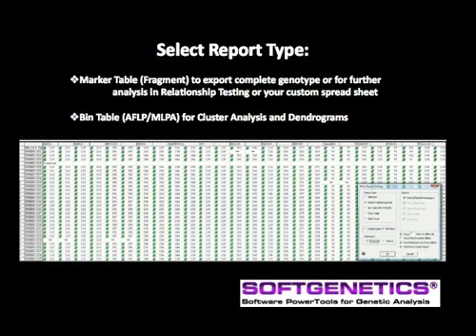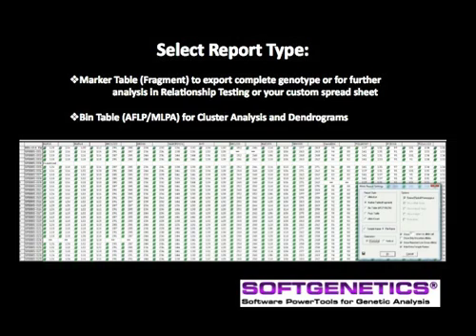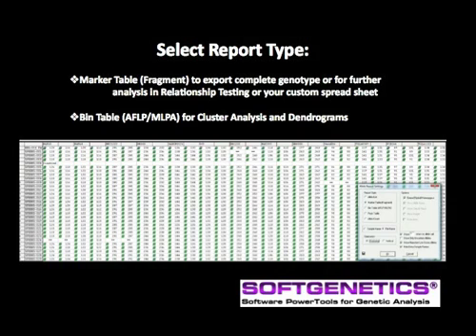Select the report type depending on what post-genotyping analyses are preferred. Select marker table to export the complete genotype for further analysis in GeneMarker's relationship testing application, custom spreadsheets, or other genetic analysis programs. Select bin table, which is AFLP or MLPA, as the report type for files that will be imported into GeneMarker's cluster analysis application.